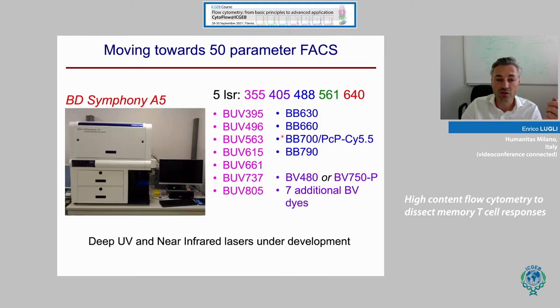So we applied a new technology. We were fortunate enough in our institute to install one of the first machines of this kind in the world. It's a BD Symphony A5. Just to say, I don't have any conflict of interest.